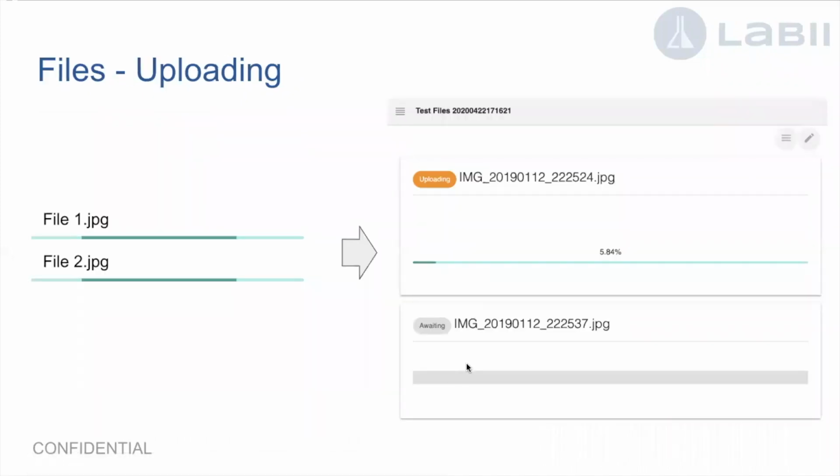And then for files uploading, you may already notice this is what's going on before. You only see something like just going files, like it's uploading, but right now everything's changed. You will see the first file loading, the second file loading. This uploading speed is based on the internet speed. If you have a quick internet speed, you will see this goes so much faster compared to a slower internet speed. So this is easier for checking what's going on in the back end.